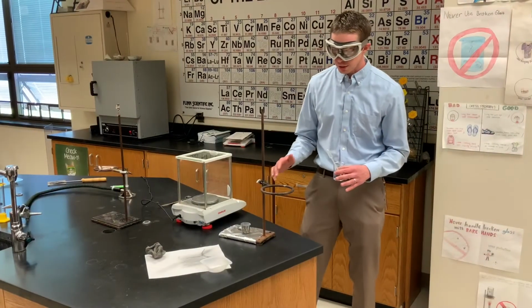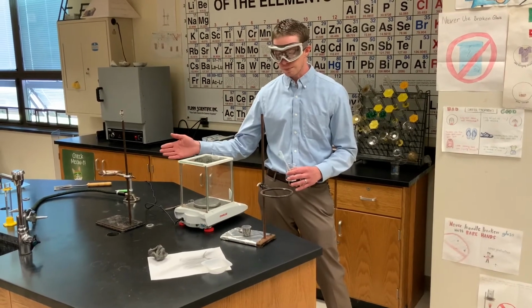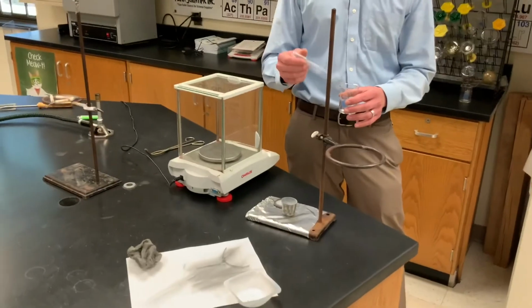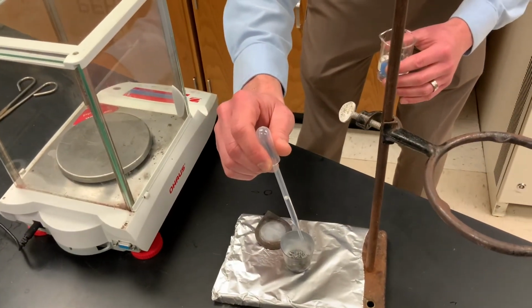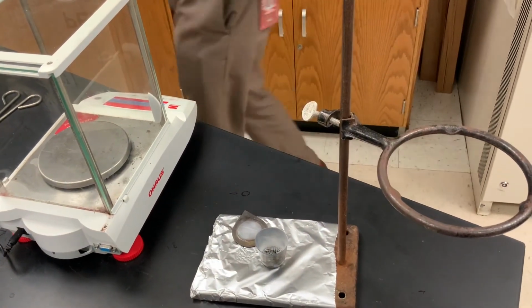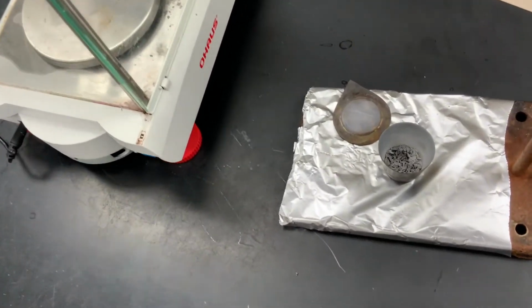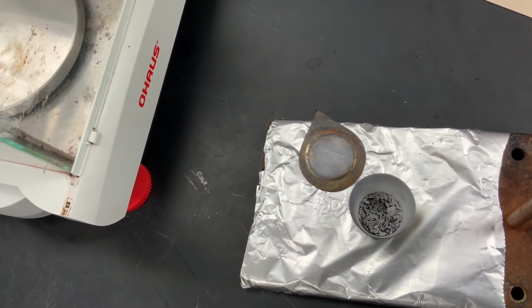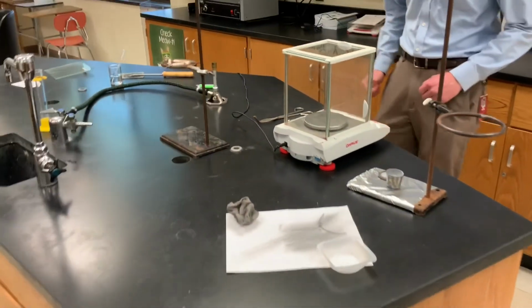All right, everybody, so here we are. We have completely heated our magnesium on the Bunsen burner over here. We've let it cool off. Now I'm going to add about 4 drops of distilled water to decompose any nitrides that may have formed, maybe like 6 drops, because not only is there oxygen in the air, there's nitrogen in the air too. And I want to make really sure that I don't smell this, because it's going to decompose as ammonia, which is going to be really terrible to smell. I smelled it anyway.